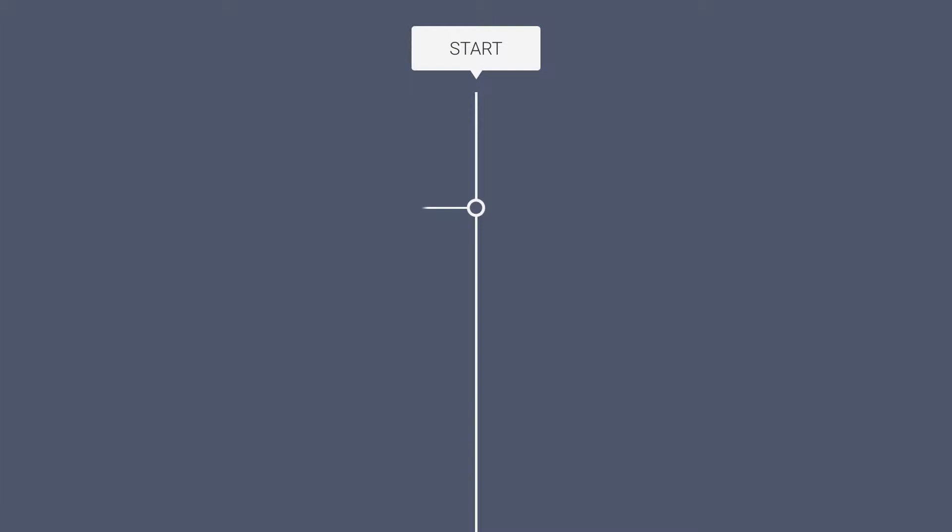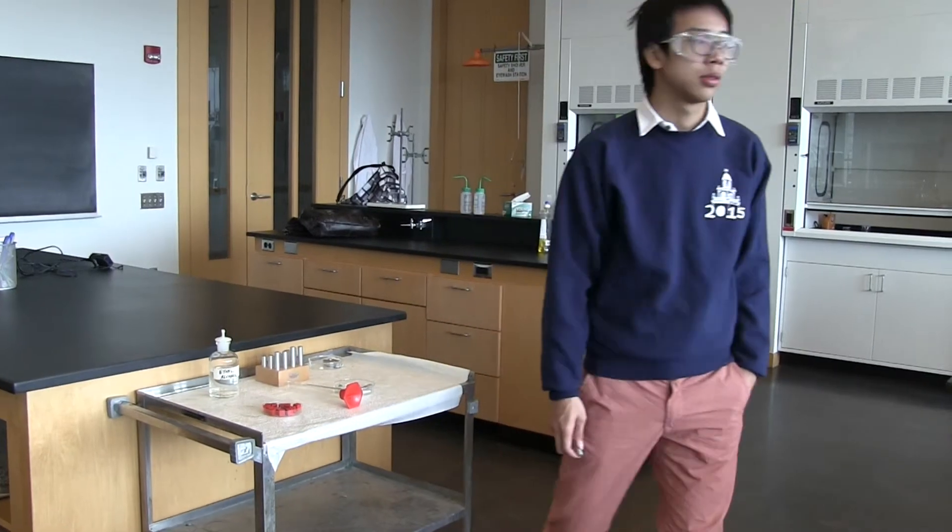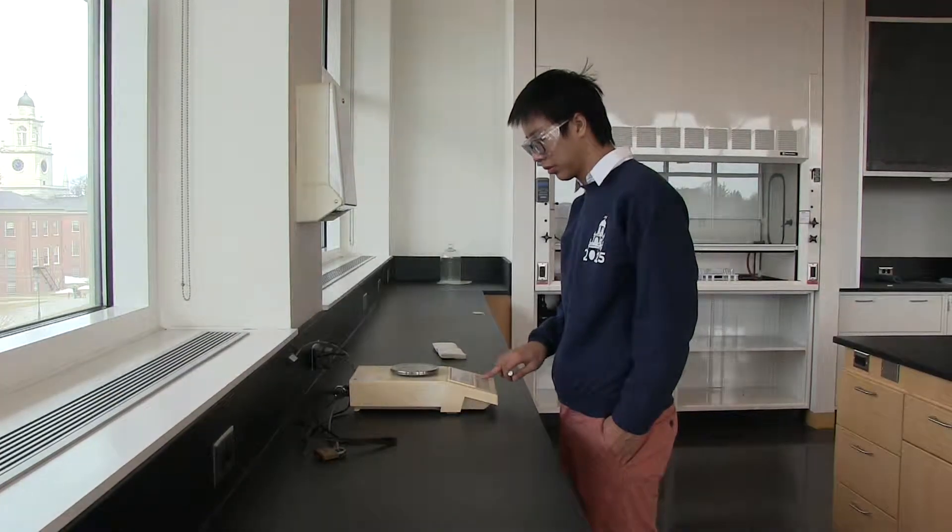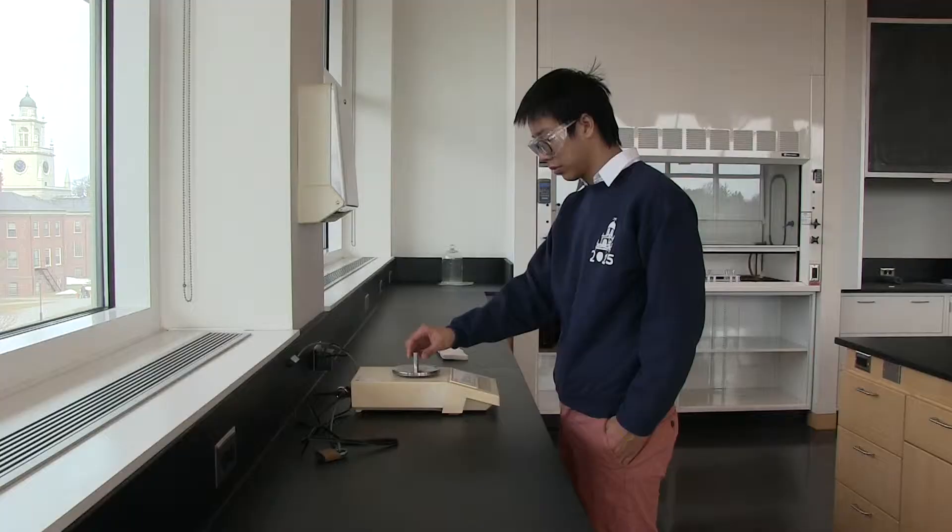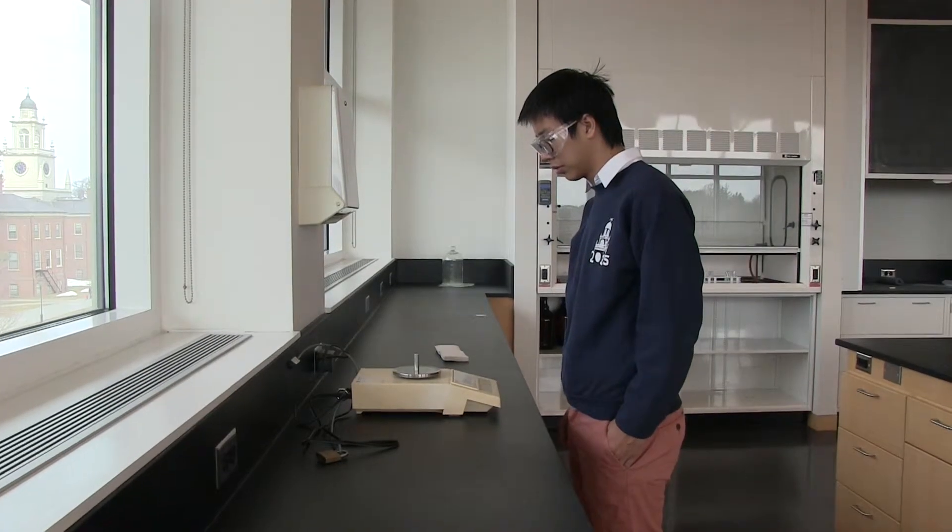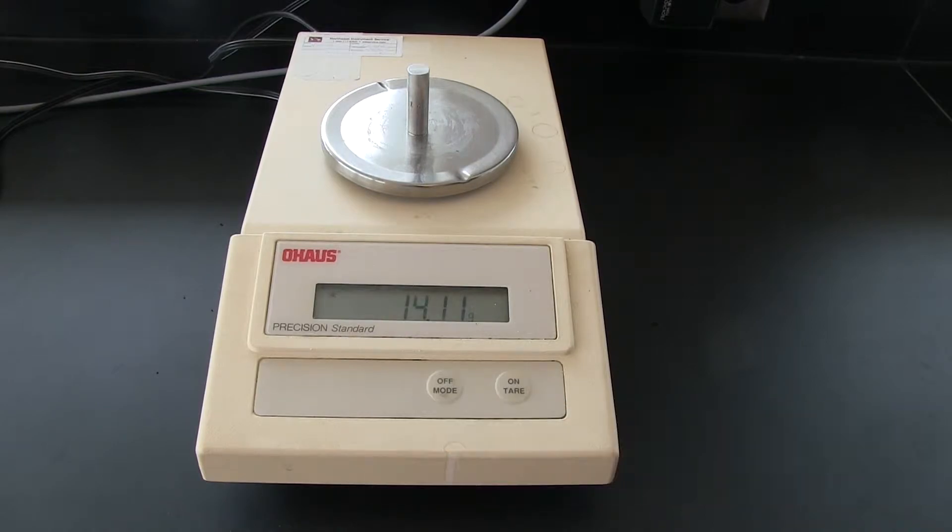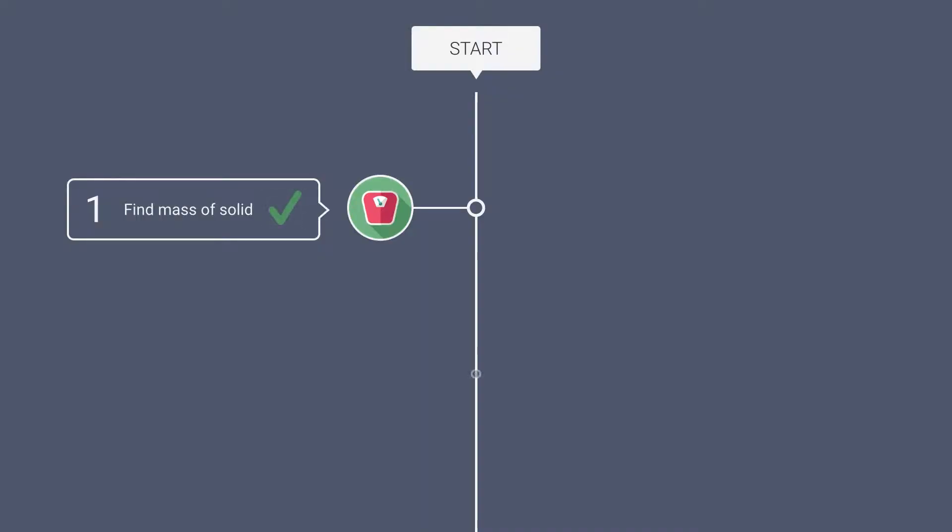Our first step is to find the mass of a solid. To start off, grab any solid from the cart in the center of the lab and head over to the top loading balance. Once you get to the balance, press the on button, wait for the scale to read zero, and then place your mass on the scale. Make sure you write down the value displayed. Pretty easy, huh? That's step one.